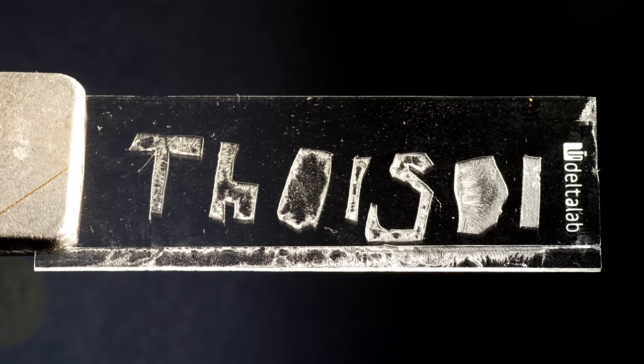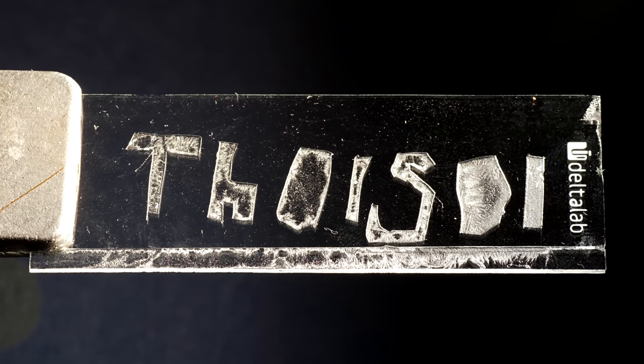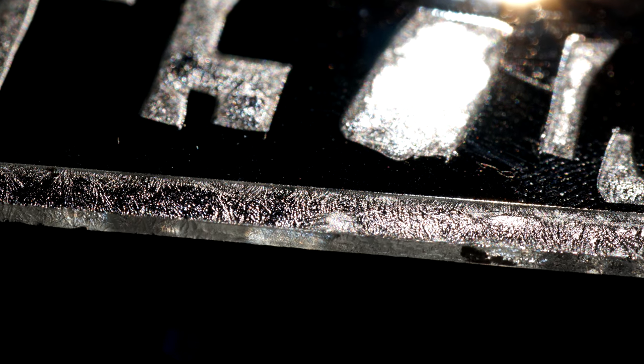By the way, speaking of patterns, now it's time to check out our inscription on the glass. You can see that the letters are made of the same coating as the coating in our jar. I also managed to remove it quite easily. Using macro photography, we can see the thickness of the glass layer that got dissolved by the hydrofluoric acid in just one hour, which is somewhat impressive. The inscription looks very distinct with beautiful blurriness on the affected area, which reminds me of crystals.